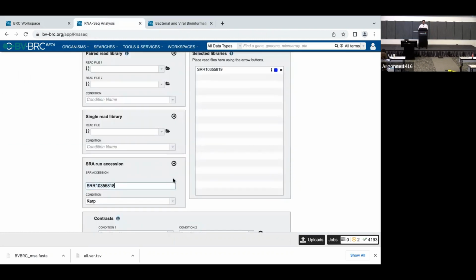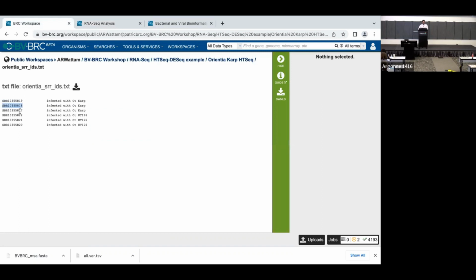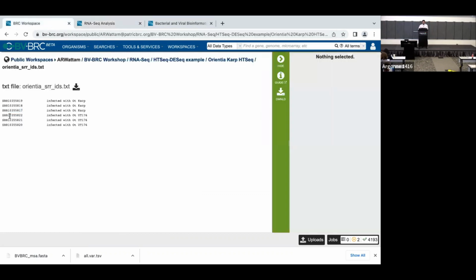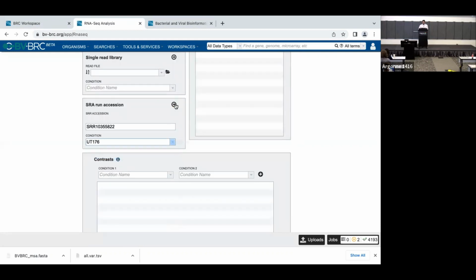And while he's doing that, the two strains that they're looking at there, one is highly virulent and kills mice very, very quickly, and the other kills them less quickly. So that's why the original experimenters were looking at this. And this came from a paper in PLOS Neglected Tropical Diseases.